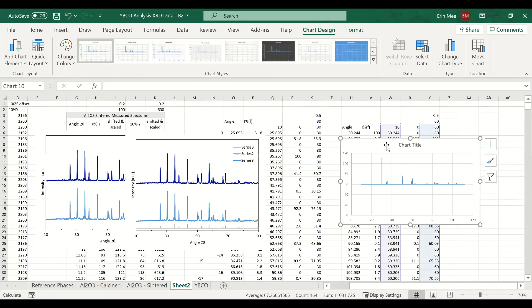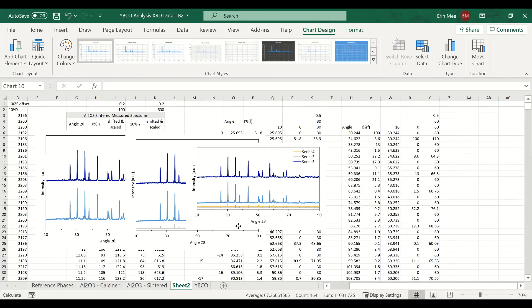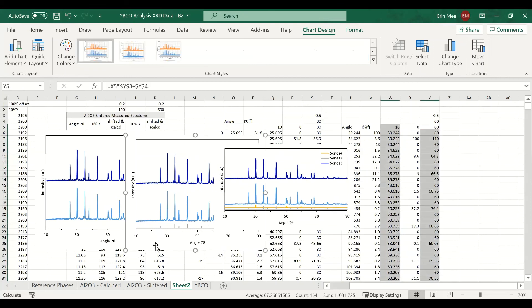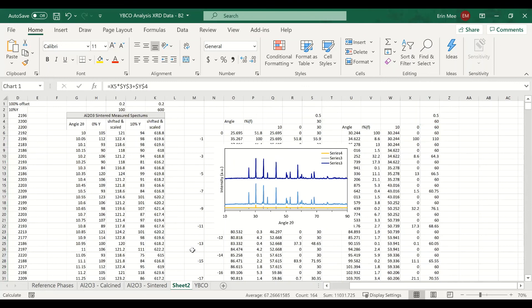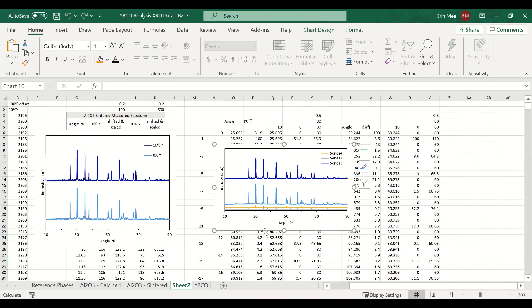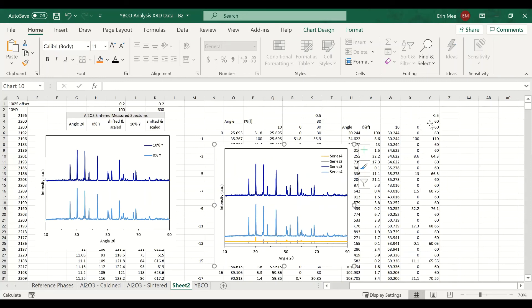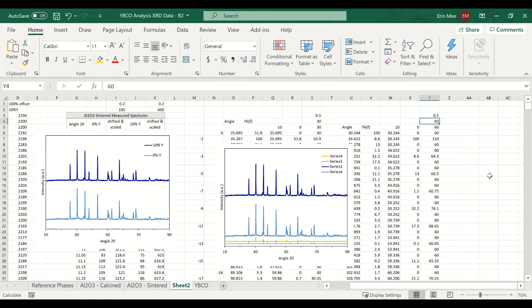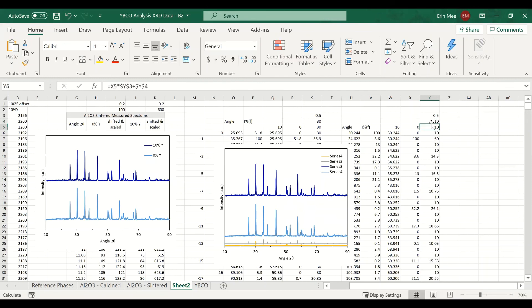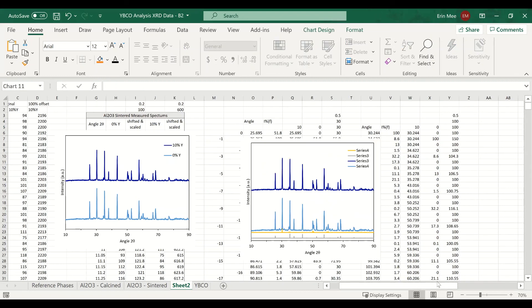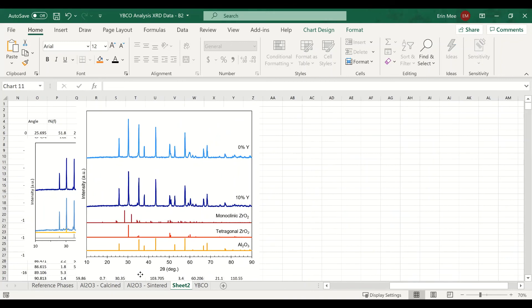I'll copy this graph and paste it onto the main one — nice and easy. Apply the offset and shifted values just to make things look nice. Here's what my graph looked like in the end after playing around with the shift values and formatting it how I liked.